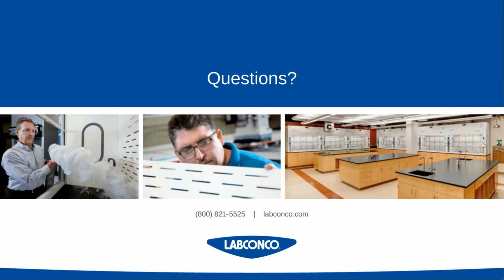Our first question is, what types of hoods are you referring to when you say conventional? Is it both auxiliary and VAV?